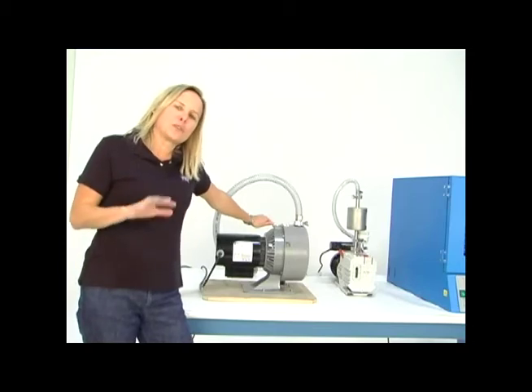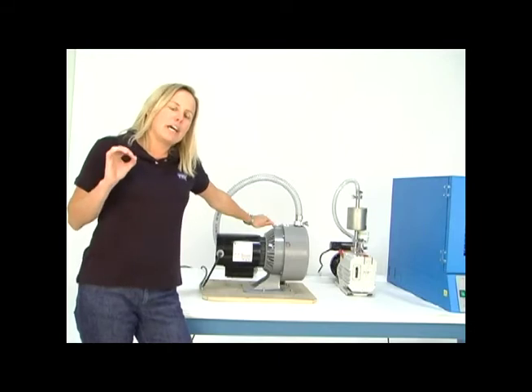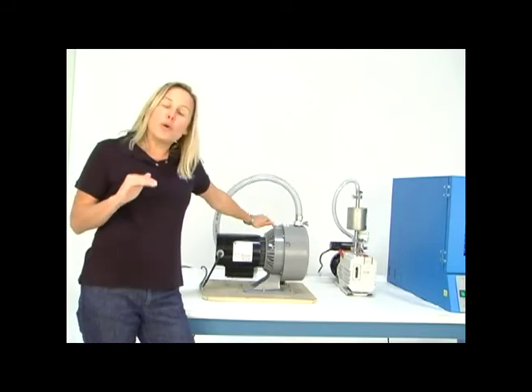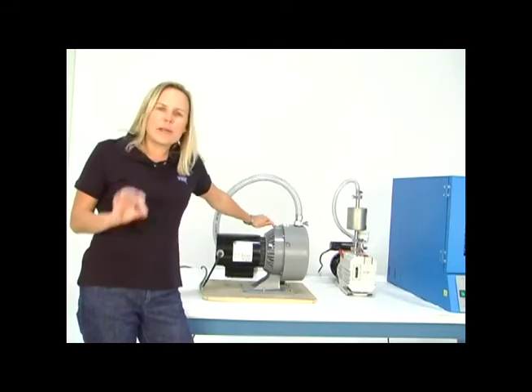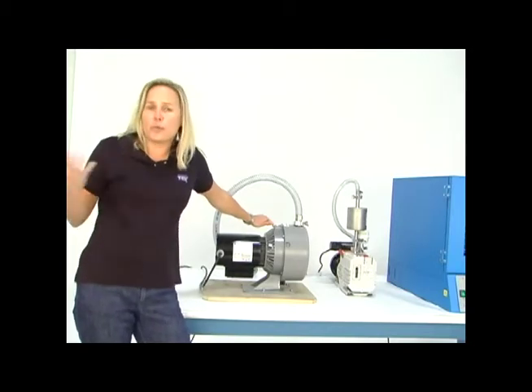I'd like to say a few words about a dry scroll pump. This is another type of pump that we offer at Cascade Tech. A dry scroll pump has no oil in it, making it a great choice if your process has to be super clean or you're working in a clean room.